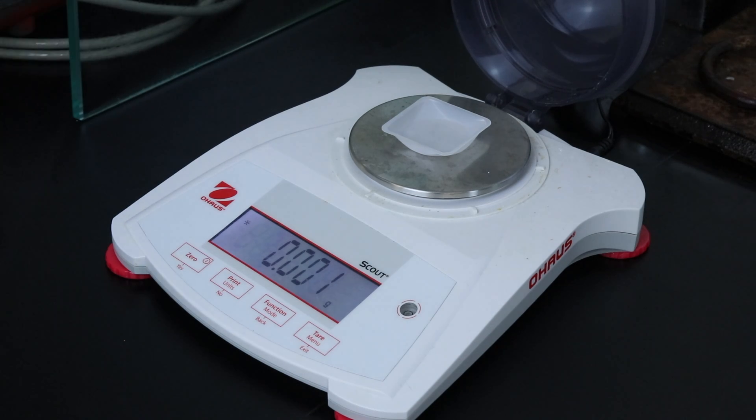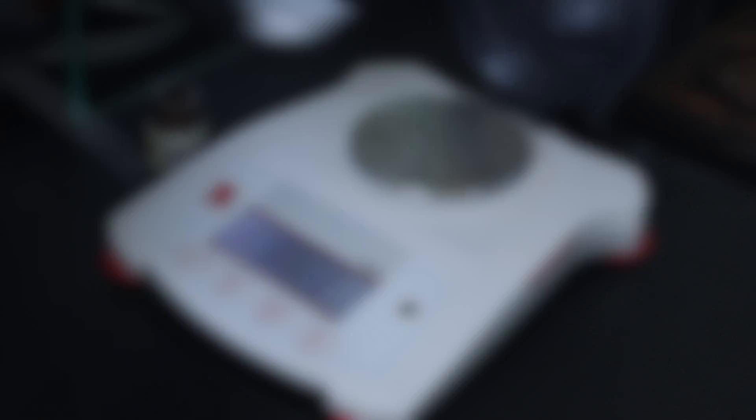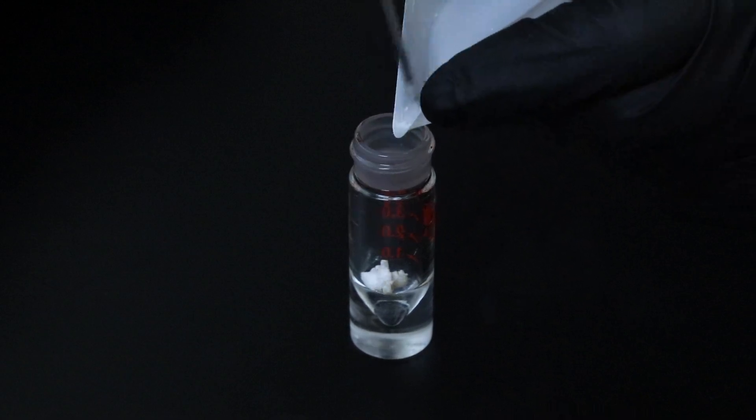Alright I'm going to start by weighing out 37 milligrams of the thiamine hydrochloride salt and add that to a 5 milliliter conical vial with a spin vane.